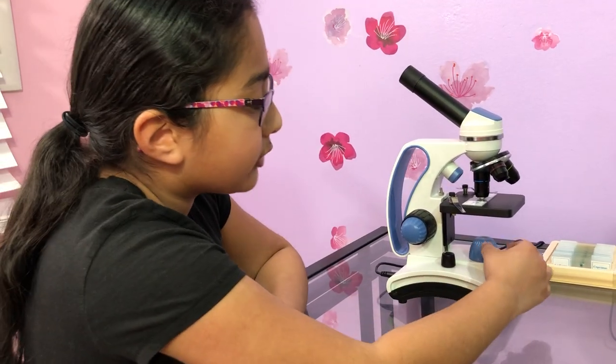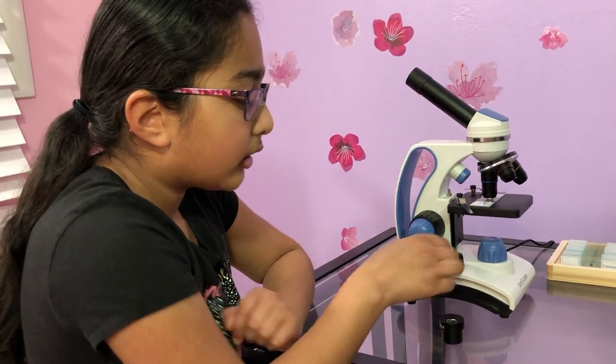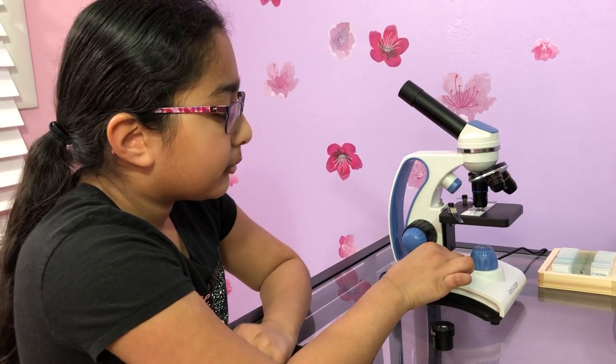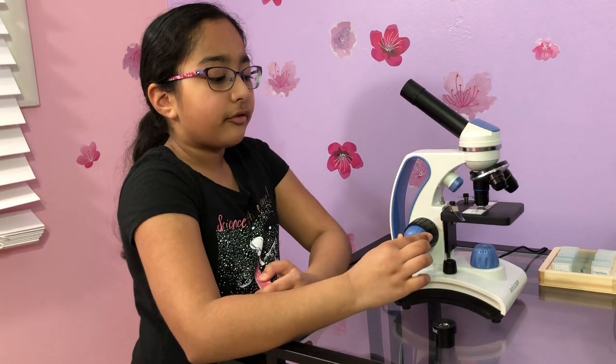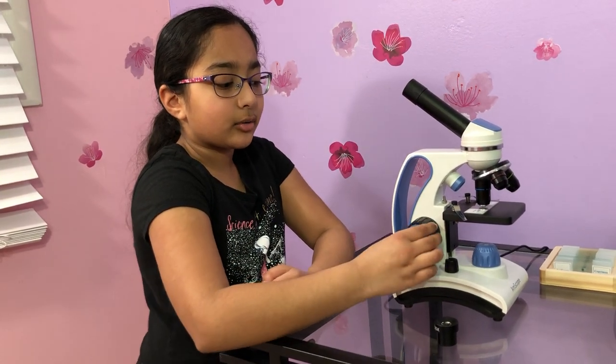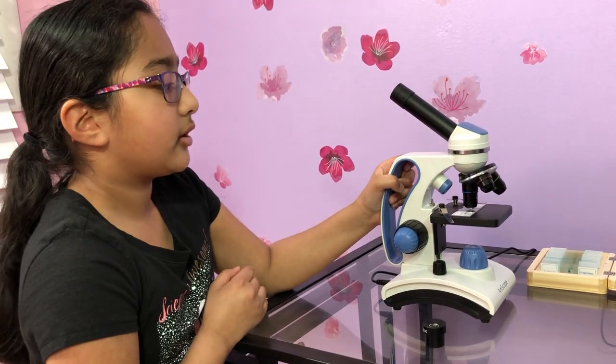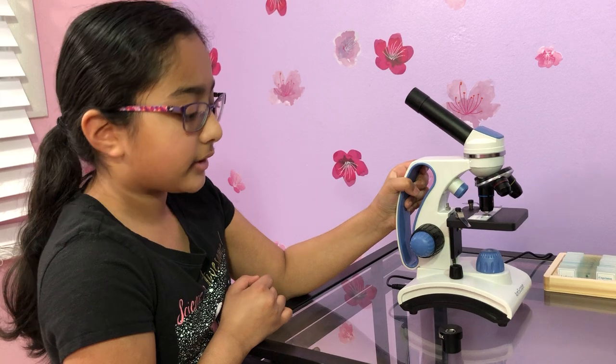Over here is the bottom light, and here's the top light, and here's the dimmer so it adjusts the light. Here is the fine adjustment and here's the coarse adjustment, and here's the handle if you want to lift it or take it anywhere.